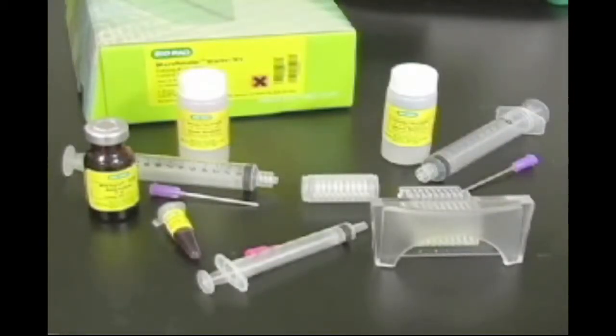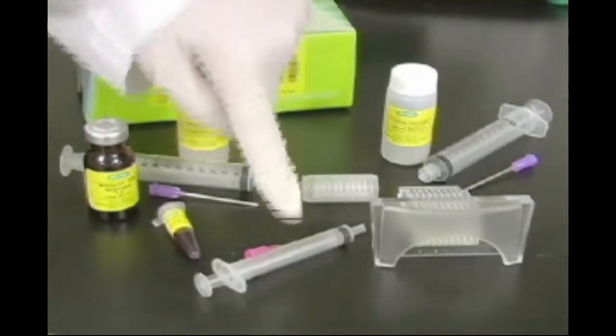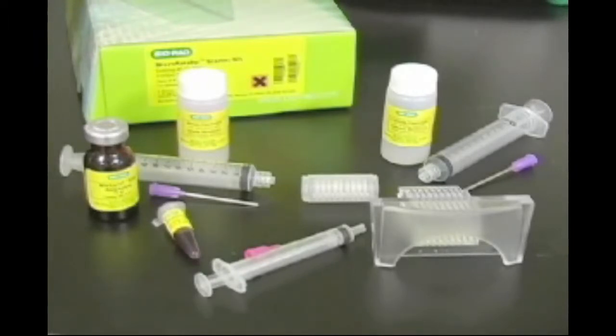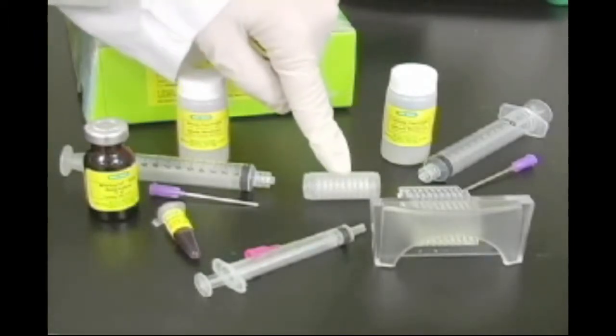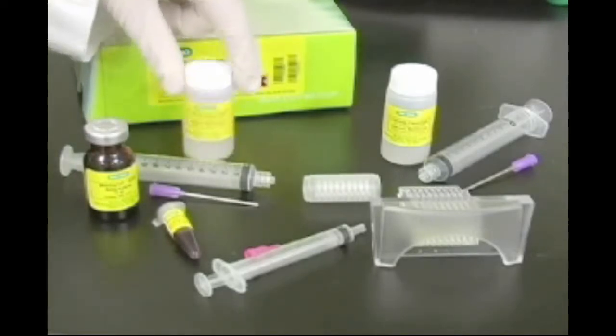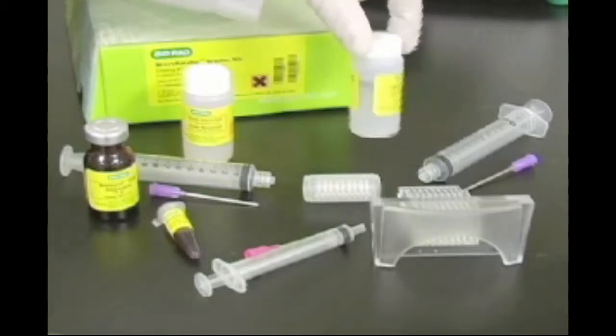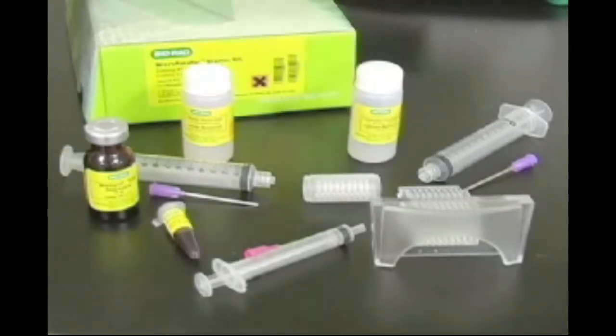In this video we will be using the Micro Rotifor starter kit, which includes two 10 milliliter syringes and a 3 milliliter syringe, a focusing chamber, anode and cathode electrolyte solutions that each contain two equilibrated membranes, Biolyte ampholytes pH range 3 to 10, and protein sample and a harvesting tray.